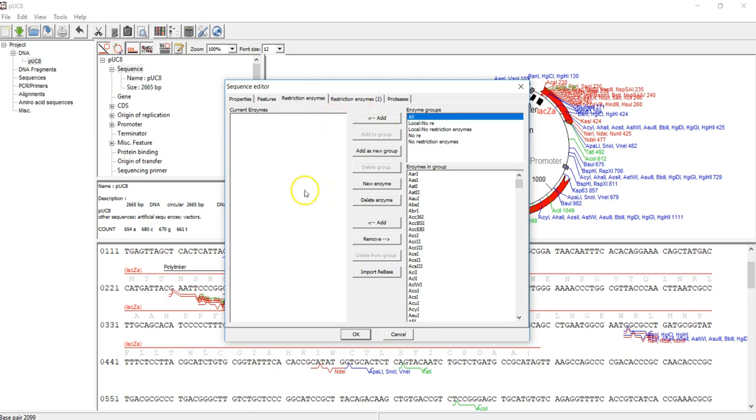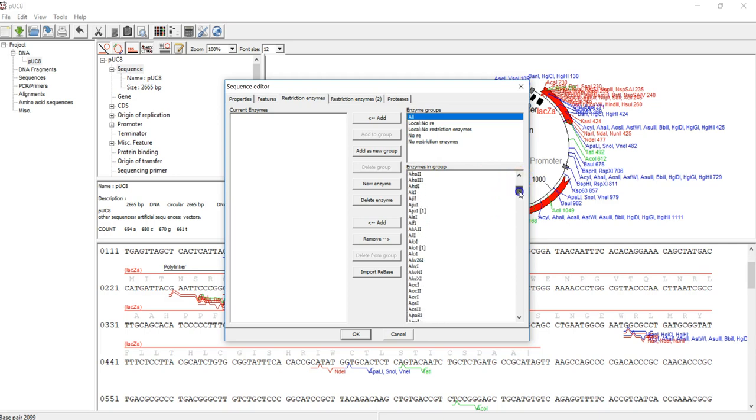In this first tab, you can define what is the group of enzymes that you want to use. We will choose the list of enzymes from all the enzymes available.